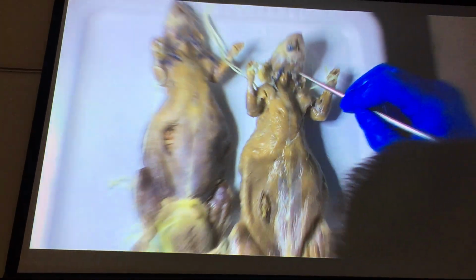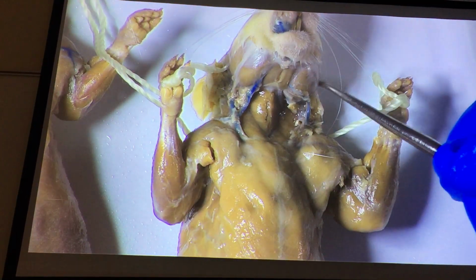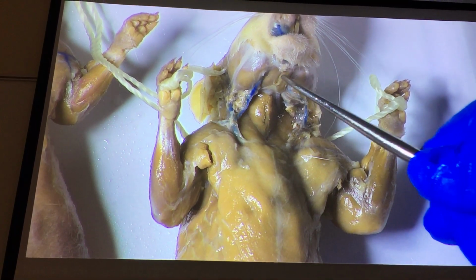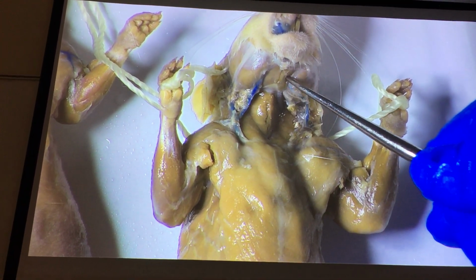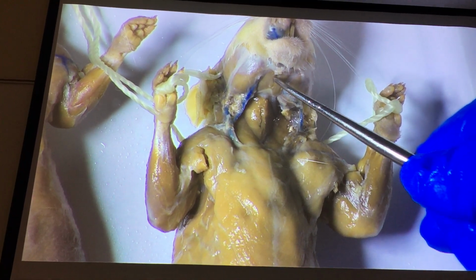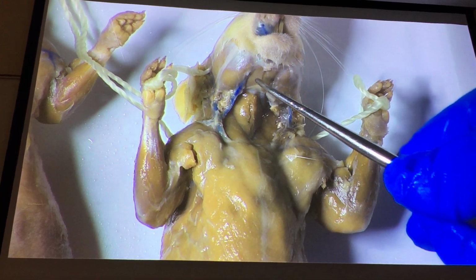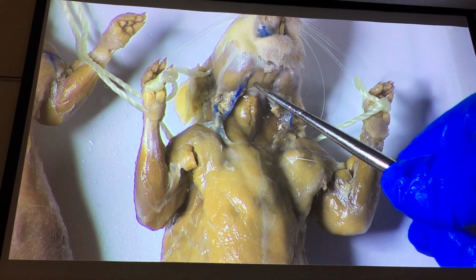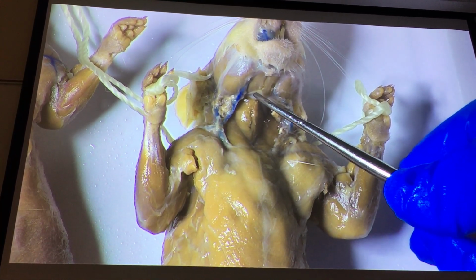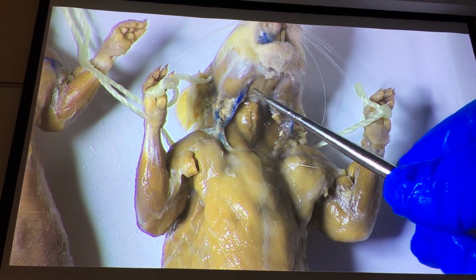So let's begin with the throat here. Here we can see the big muscles on the side. Those are the masseters. Between the 2 masseters, we have our 2 digastric muscles. What muscle is this homologous to in the shark? Ryan knows, because I picked on him last week about it. The digastric? Yeah, what are they homologous to in the shark? I'm sorry? Intermandibularis, you said? Yes, it is. Good job.